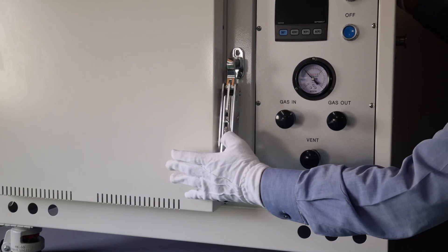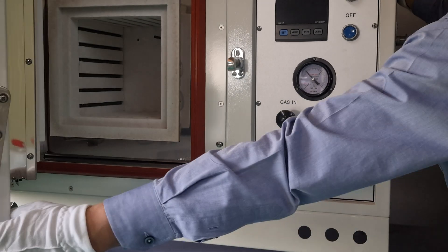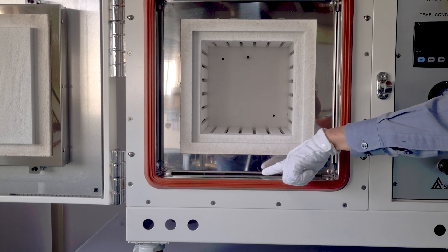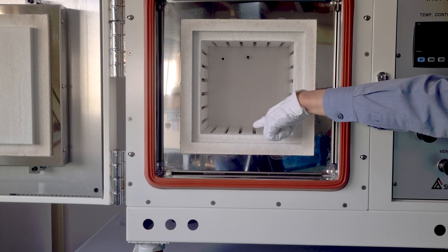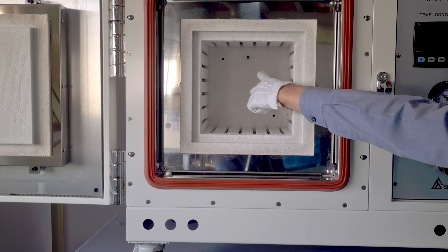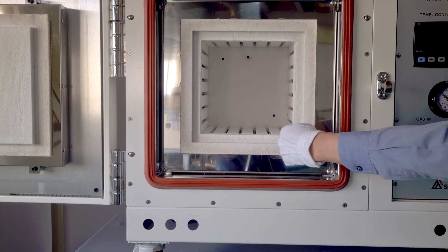You'll open the furnace by gently pushing the handle and lifting the lock. Inside, there's a ceramic vacuum chamber surrounded by a stainless steel box, heating plates with heating elements on four sides, a temperature sensor, the gas out port on top, and the gas in port on the bottom.